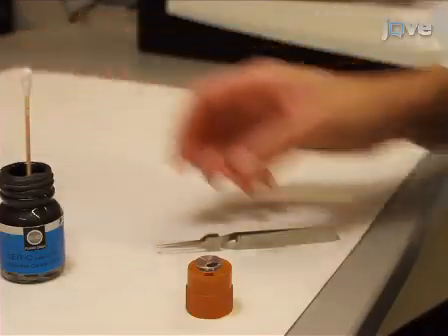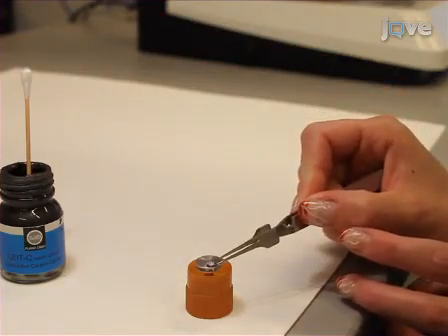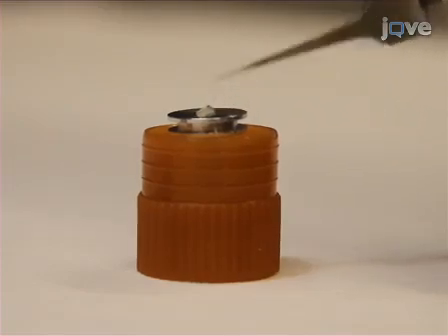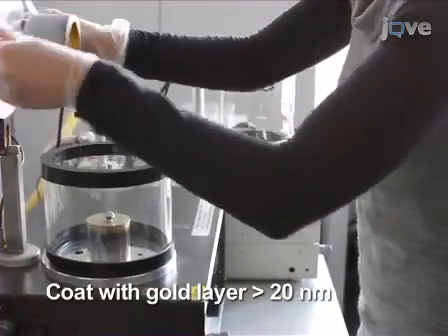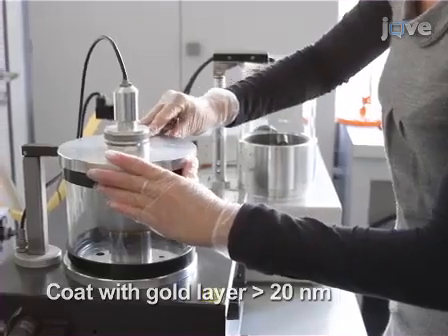With carbon paint, stick the sawn-off block onto an SEM sample holder and orient it so that the side to be imaged faces the outermost edge. After the glue has dried, transfer the preparation to a Cressington vacuum evaporation system and coat the block with a thin layer of gold greater than 20 nanometers.